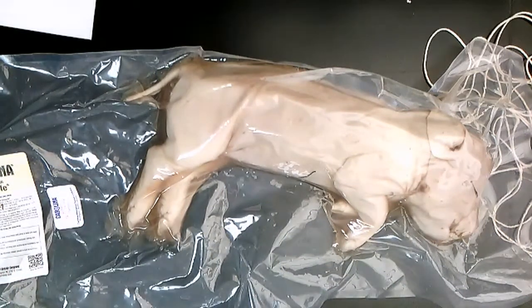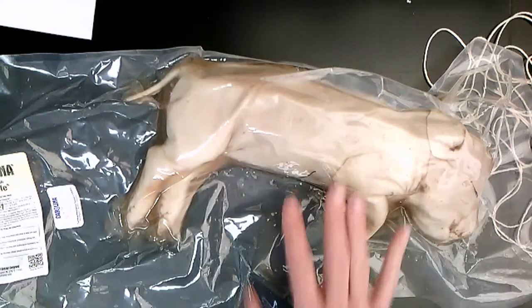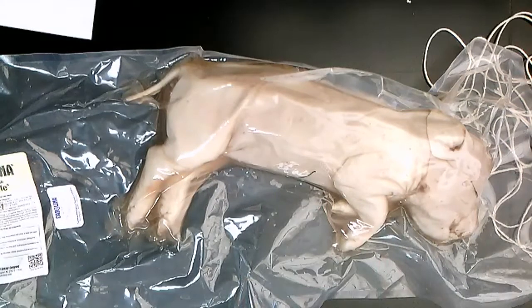I think you can order them as small as 6 to 8 inches. However, since they're bigger, it's going to be a little bit easier for your students to identify organs, and it's also going to be less of a safety hazard when there are fingers and scalpels and scissors. So I would suggest that if possible, you order the larger pigs so that your students practice on what they're going to actually have to dissect the day of the CDE.